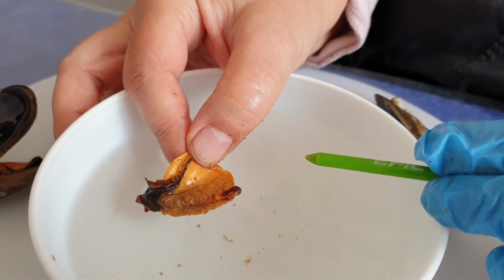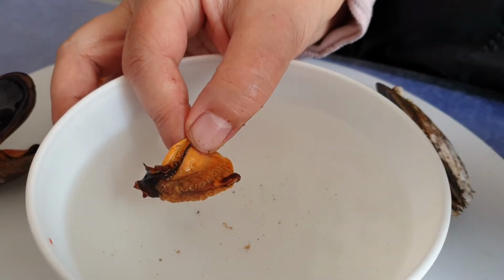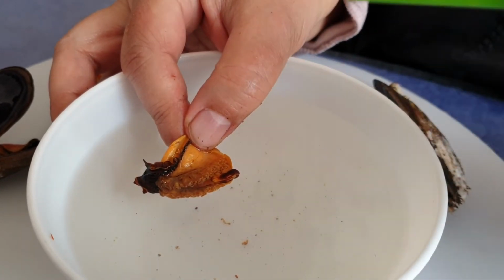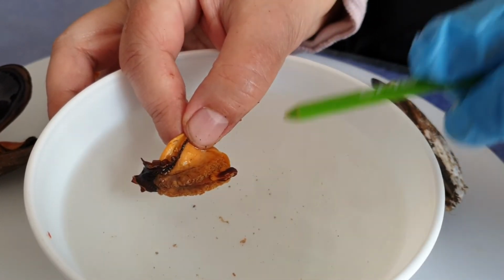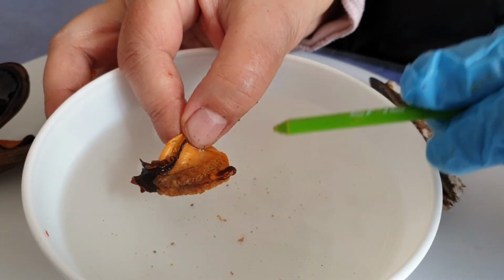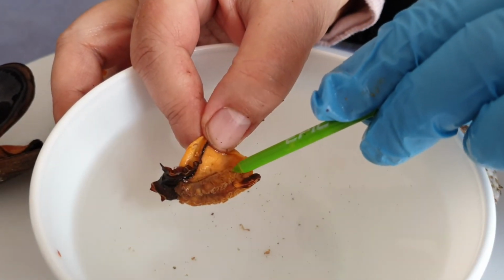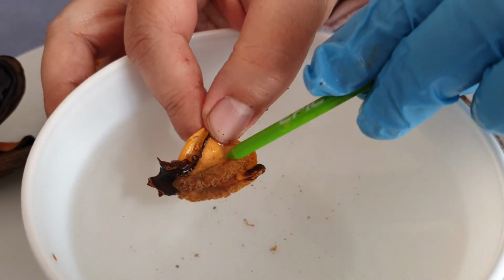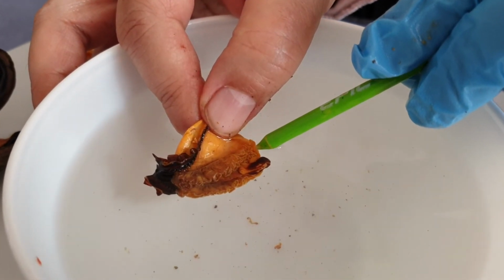For ending, I would like to show you in water the mussel, because when we put the mussel inside the water, you can see much better the gills. These are the gills. Look at this. They are like sheets of a book.